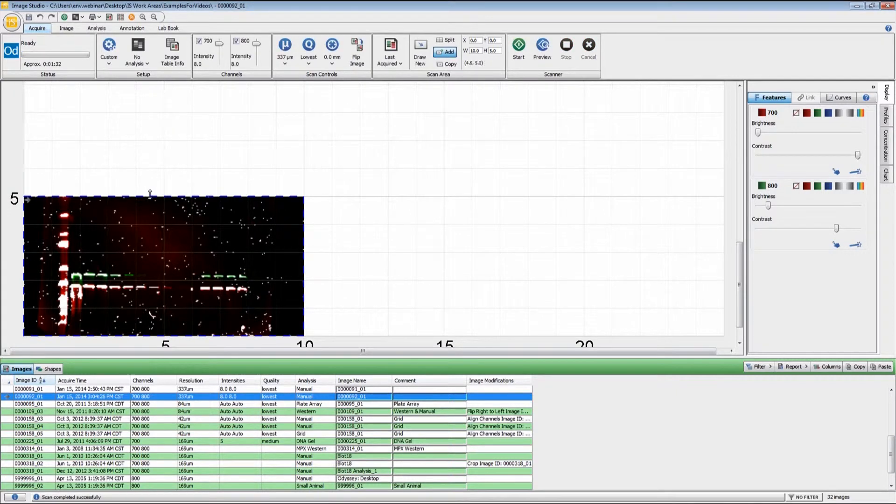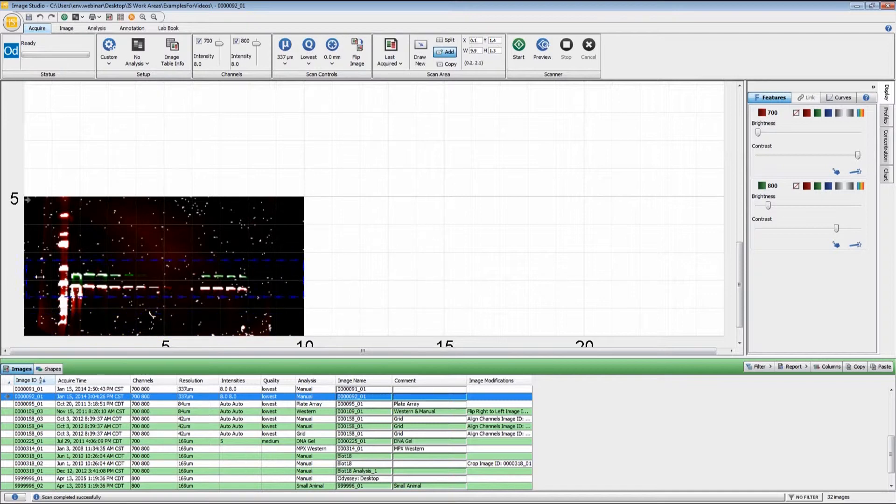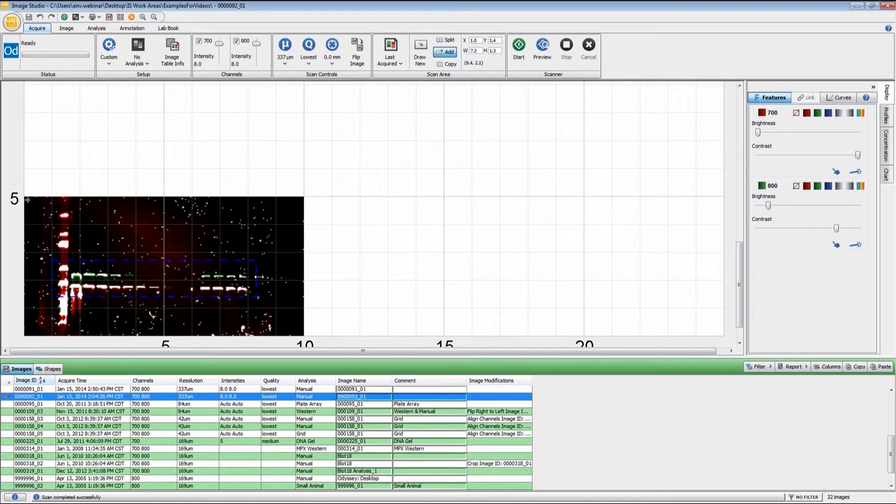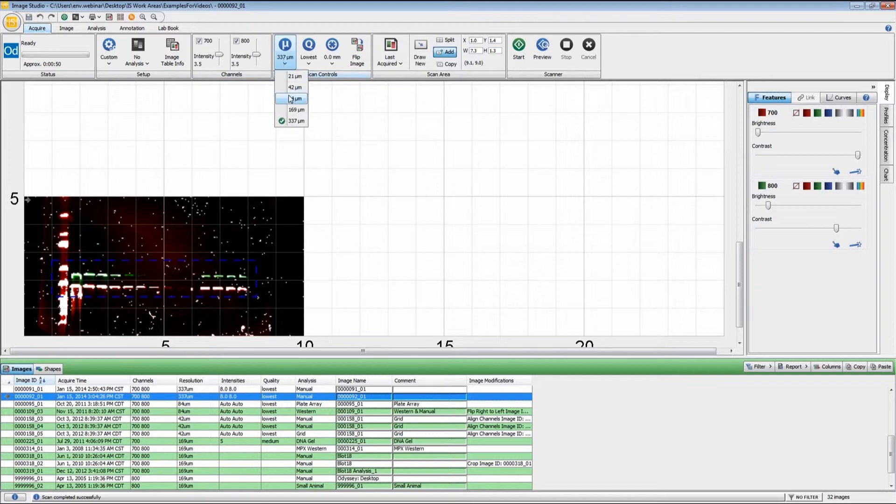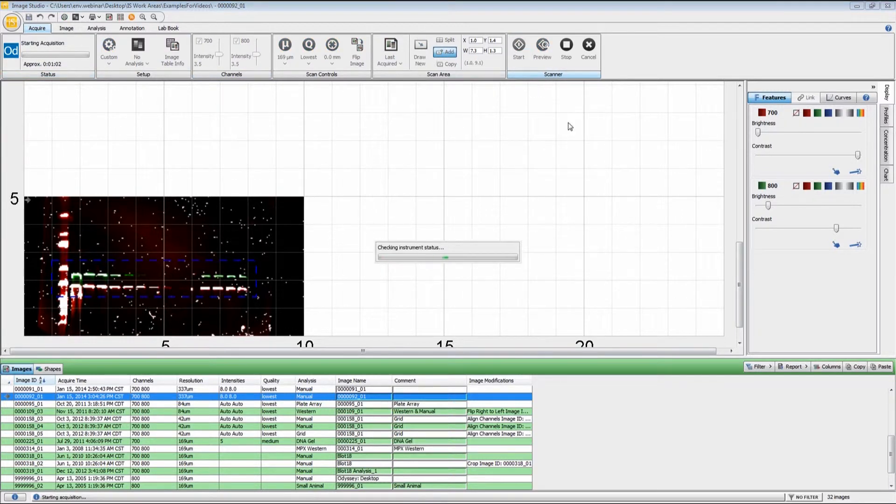Once that has finished downloading, I'm going to reset my scan area. We do have millimeter increments, so it does give you the ability to do some fine tuning with this. Now I'm going to turn my intensities down, increase my resolution to 169 microns, and once I change all that, it gives you an approximate scan time right there. I'm going to click start.